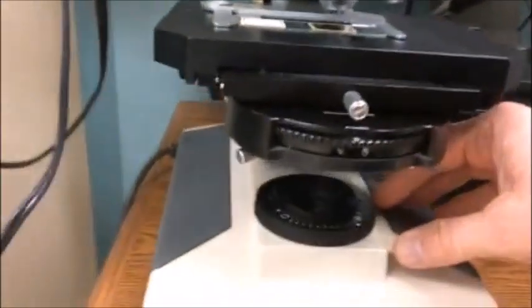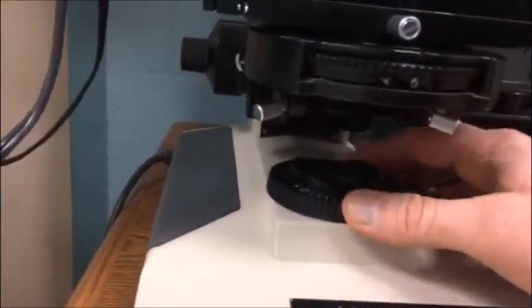I bumped this so many times it's not in focus. There it is. So at that point, you want to go ahead and open the field diaphragm until you can no longer see the darkness around the edge. That'll go like this. So that is basically the end of the condenser adjustment.